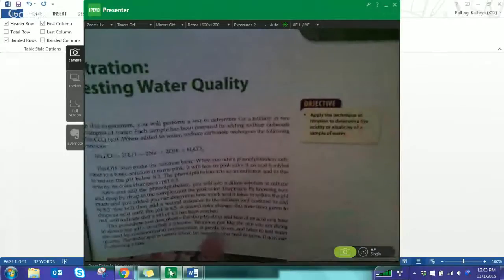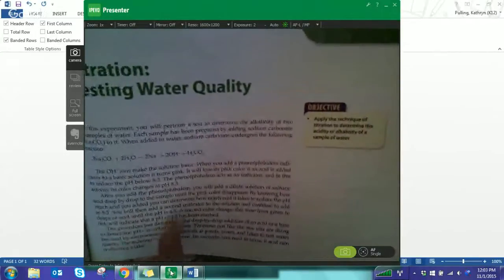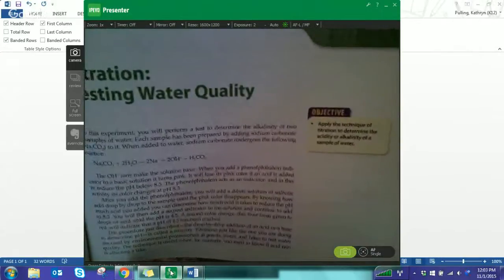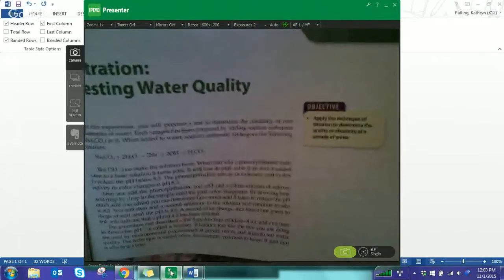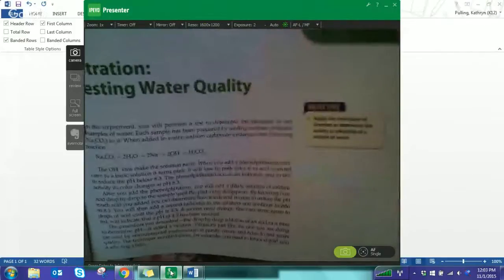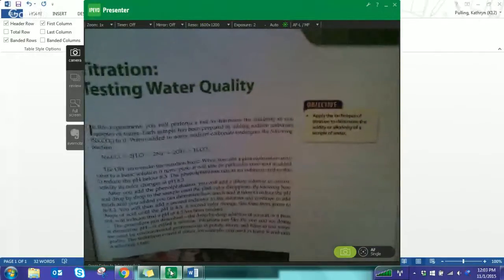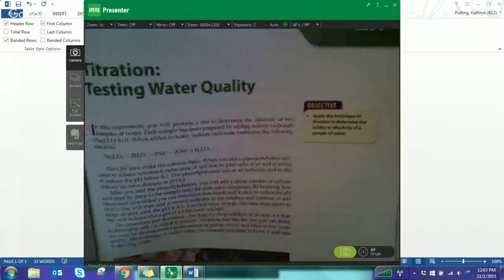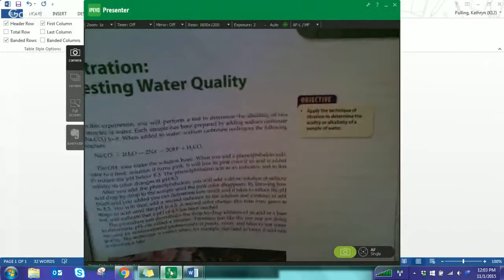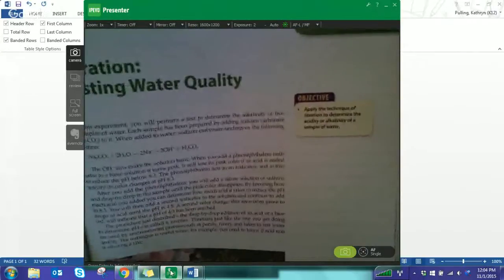Another pH to make note of, as later we're gonna add a second indicator. The name of it's actually in the procedure, but the second indicator is this total alkalinity indicator. And this is an indicator that will turn red if the pH goes below 4.5, right? And it's going to start out with a green color when it's above 4.5. So we'll see that as we go through sample A. So I'm going to flip to my procedure here.